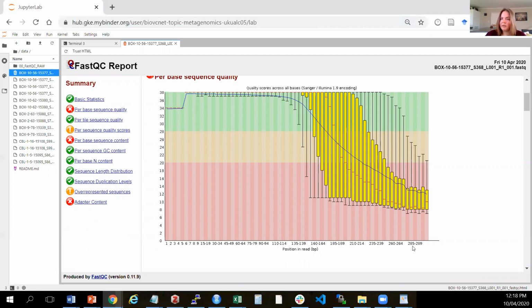This will change depending on the type of sequences that you've put in. What it's showing you is those Q scores or those Phred scores on the y-axis here. The green is saying that yes, the machine was very confident in its call. Orange is, well, maybe it's okay, but we're not as confident as we were up here. And then red is generally an indication that the machine wasn't very accurate at that particular base call position.